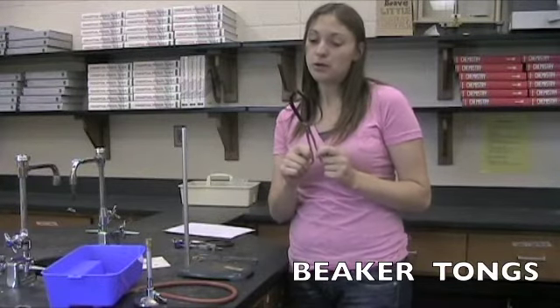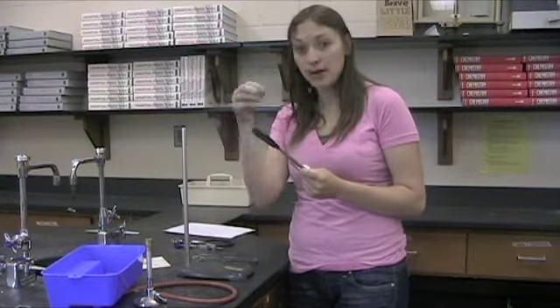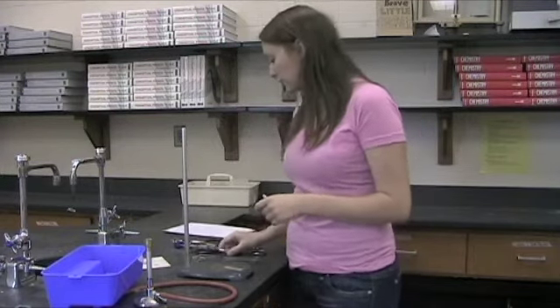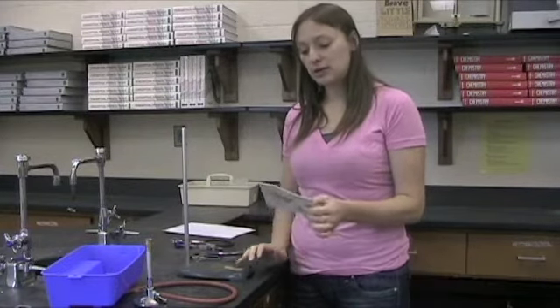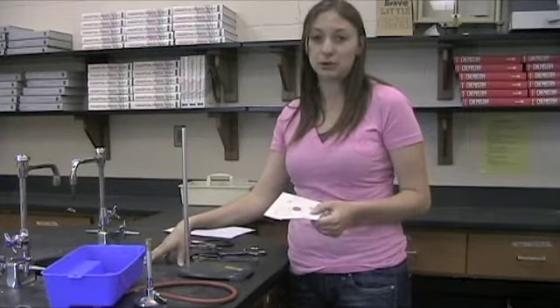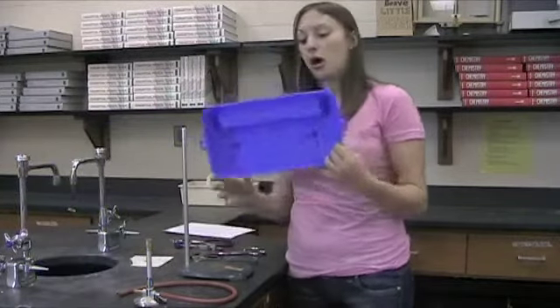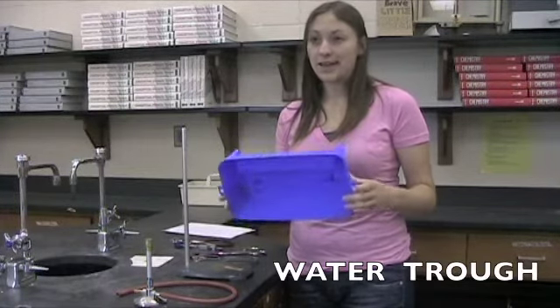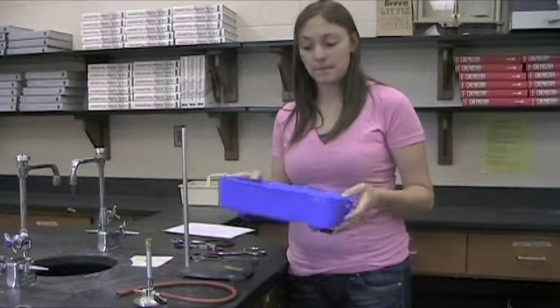Beaker tongs used to move larger items. Unlike the crucible tongs, which is for smaller things. This is used for beakers, especially if they're hot and you don't want to grab them. Ceramic square is used to hold hotter items. That's how they get the burn marks in them. But it's sometimes better than putting on the lab table. But the lab tables are usually pretty sturdy as well. And then we have our water trough. Which is usually used for gas collection labs. Or if I need an ice bath. These are useful for that.